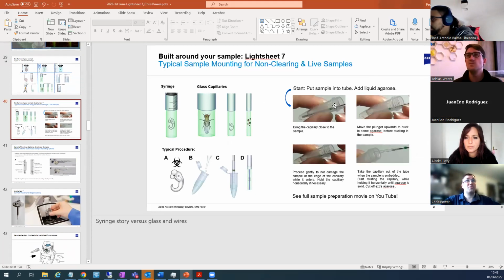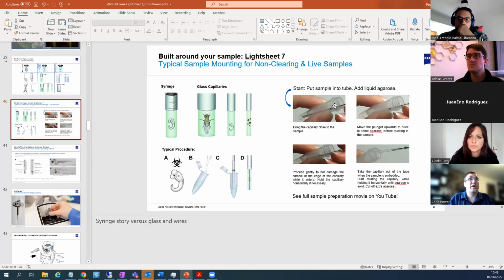So your whole optical system is square, because you're going from chamber coverslips through water and then through, whether it's round or square, it doesn't matter, because if the agarose is matched nicely, it doesn't matter. So people just use round capillaries and round plungers because that's what was available in the community. That's what's used in science. So we go with what's there. And to be honest, the plungers probably work easier round.